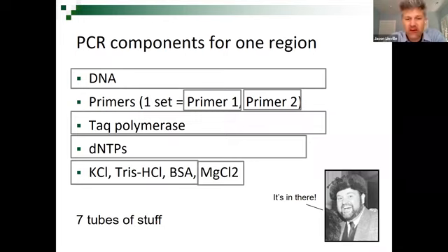Okay, so let's say we're sitting down and we go, okay, we're going to amplify D5S818 from Dr. Linville. What do we need? DNA. Okay, well, that's going to be my extraction. If we were amplifying your DNA, we would take your extraction that you did in class when you swabbed your mouth and then put it through all the steps. Take that out of the freezer. It's in a tube in front of us.